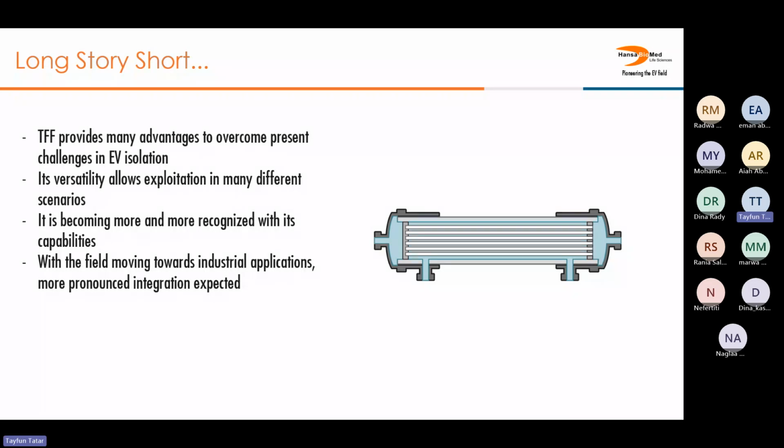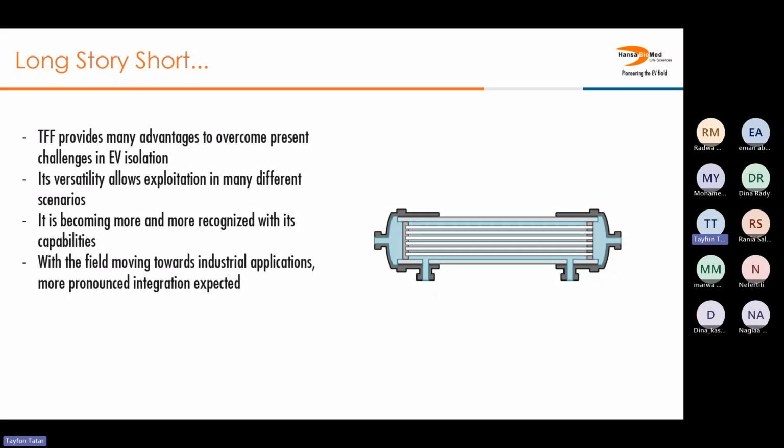And especially after the recognition by the MISEV guidelines presented by the International Society for Extracellular Vesicles, it is becoming more and more established and recognized in the field of extracellular vesicles. And since the field is now moving more towards applications from basic science, and since the advantages of tangential flow filtration are more important in these industrial settings, it would be wise to expect that in the coming years, TFF would be more and more embraced by EV researchers.